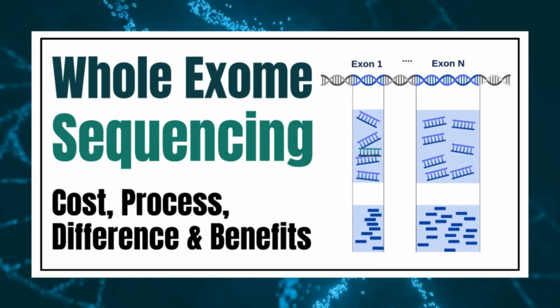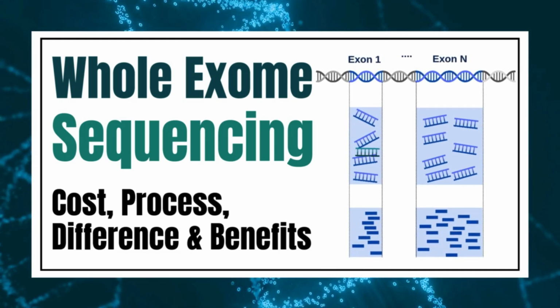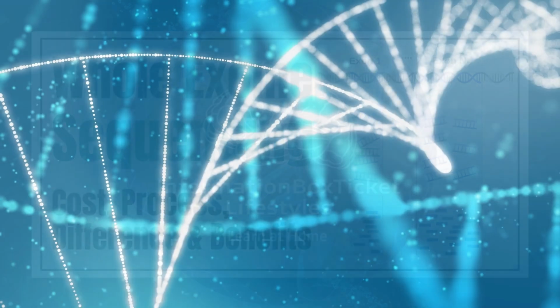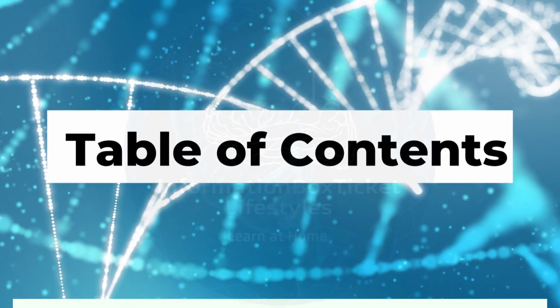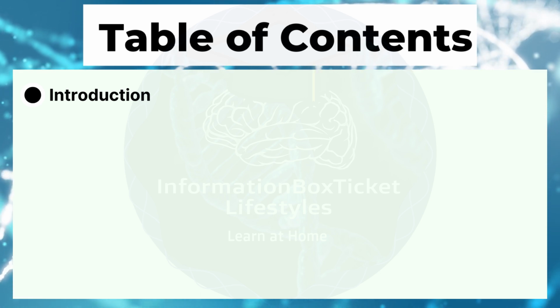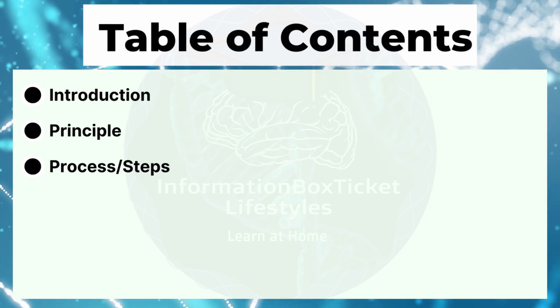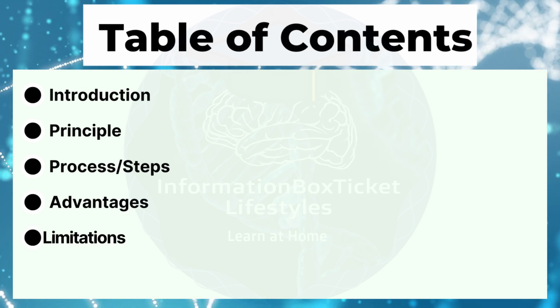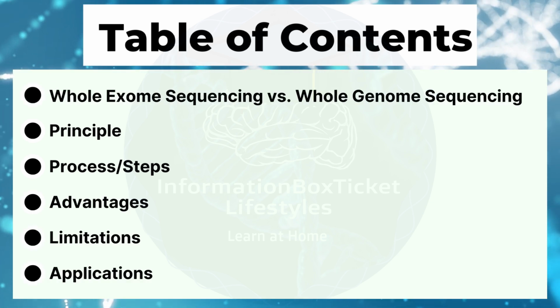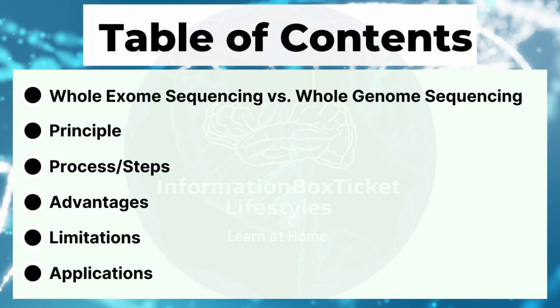Whole Exome Sequencing, WES. Explained, cost, process, and benefits. Table of Contents. Introduction to Whole Exome Sequencing. Principle. Process steps. Advantages. Limitations. Applications. Whole exome sequencing versus Whole Genome Sequencing.